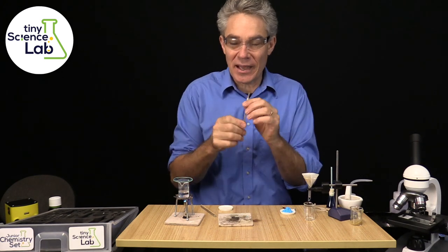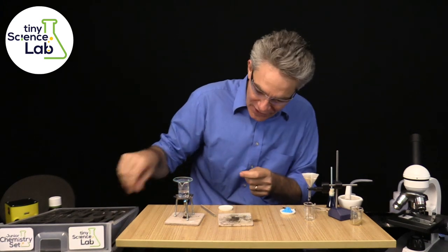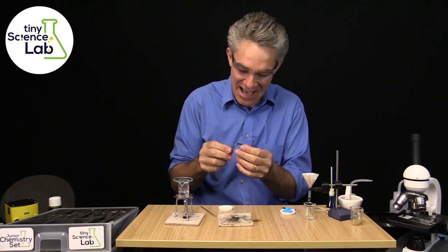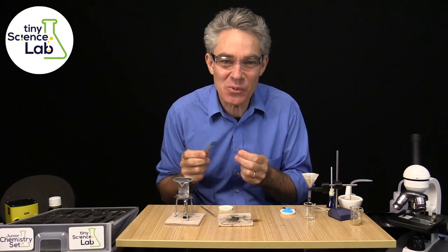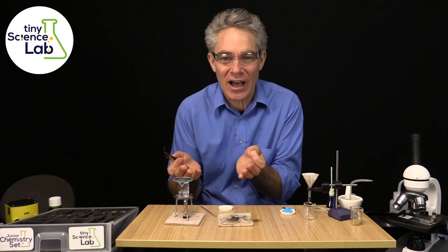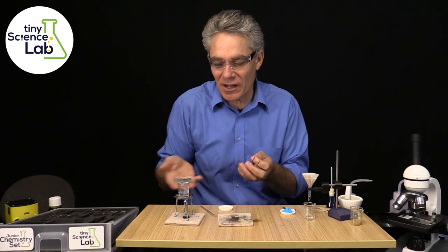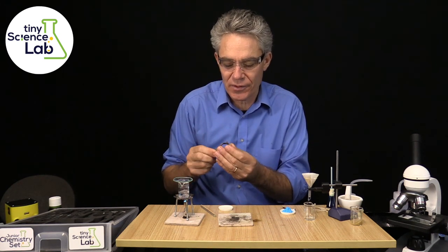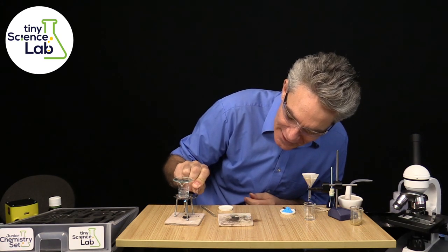I've got a little piece of magnesium ribbon here. Let's cut off some of that magnesium ribbon. I can already see that the water bath is already boiling — it happens so quick. It's exciting. Not only is it quick, it's safe as well, because there's just such a small amount. Even if it tips over, there's only a couple of mils of hot water — it will just spread a little bit on the table and the likelihood of causing injury is almost zero. Now I'm actually going to put a bit of magnesium in this flame. Kids love doing this.